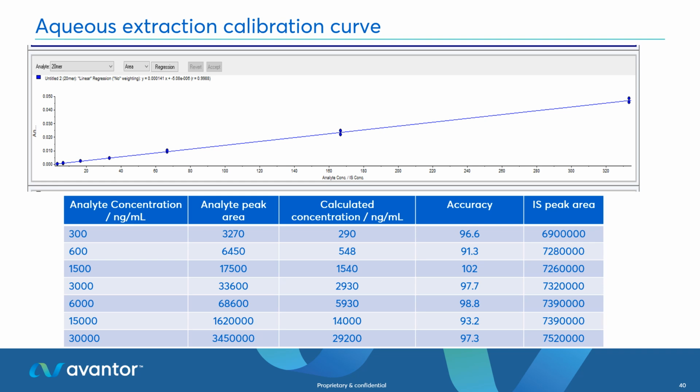So in this case, we've identified that water is better than any water methanol mixtures in terms of optimizing the elution. So overall, we've started to really focus on the pertinent chemical points, the chemistry that is going on between our oligonucleotide and the stationary phase molecule that comprises the SPE media. And this approach could be applied universally across the range in order to optimize the chemistry.